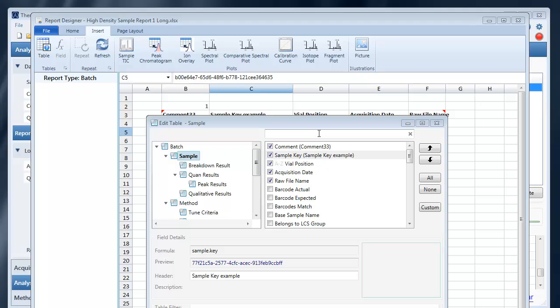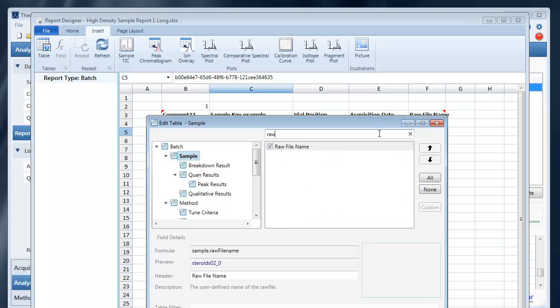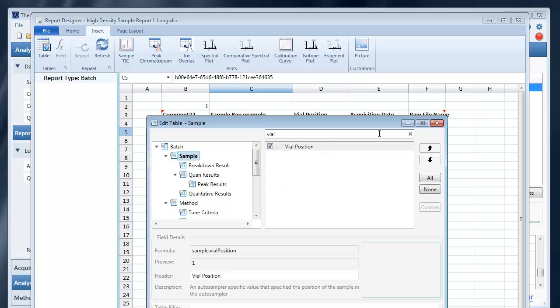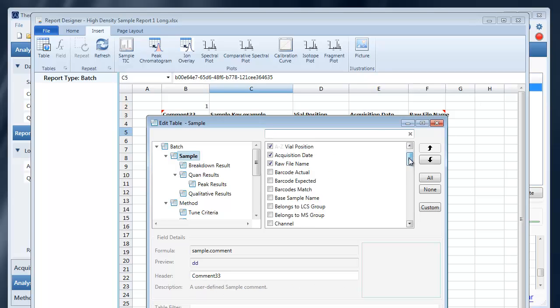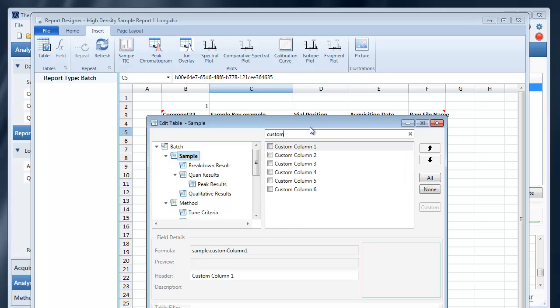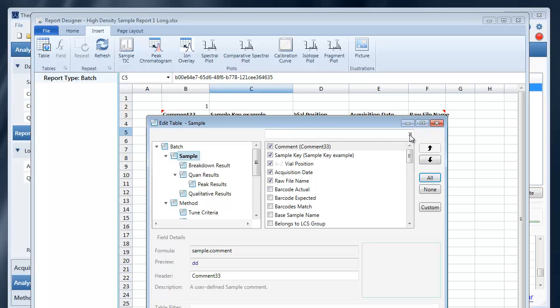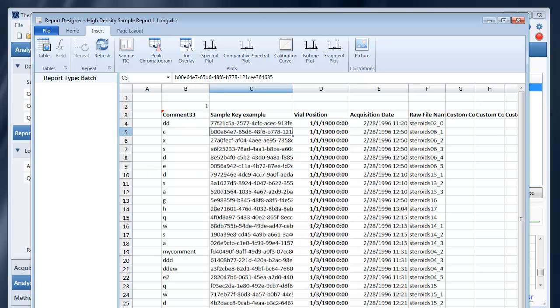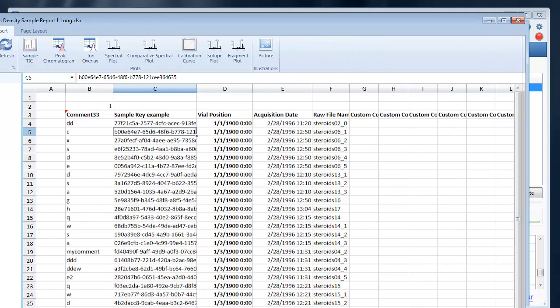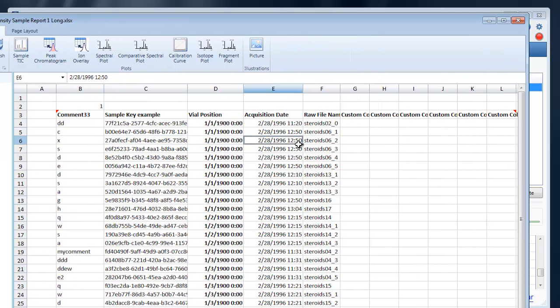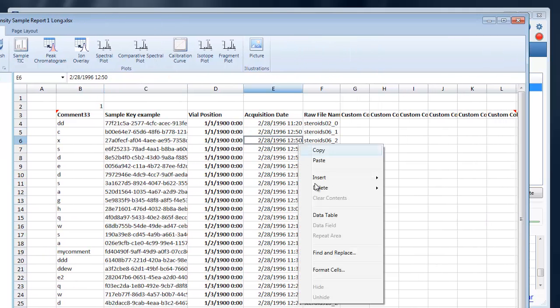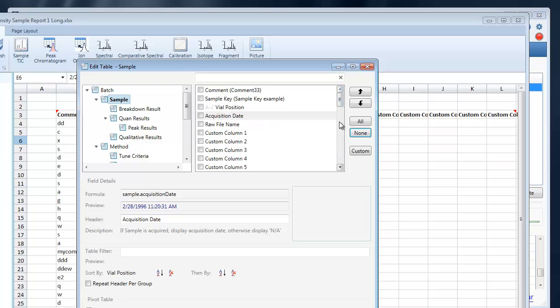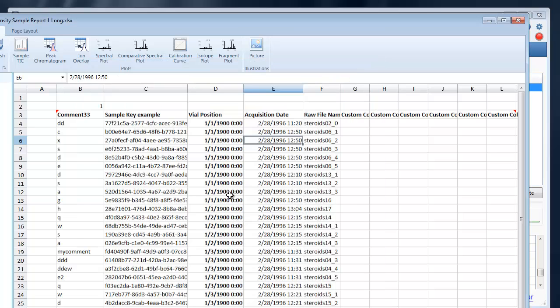A couple tips for finding the field that you're looking for. Sometimes this list of fields gets rather long. You can use the quick search to search through that list of fields. You can also use the select, which will select all of the filtered fields, or you can choose the none, which will remove all selections.